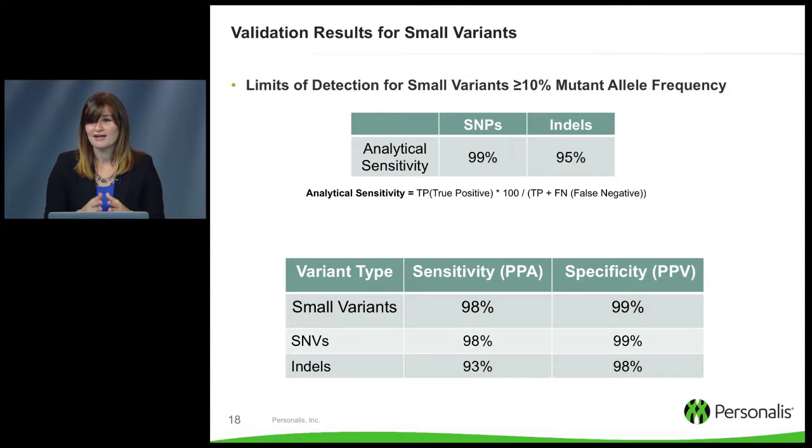We also conducted a series of reproducibility and titration experiments. So in total, validation of our ACE cancer exome required sequencing and analysis of over 70 samples and resulted in over 7,000 SNVs and 380 indels assessed. So this just stresses the fact that more well-characterized reference standards are needed for large cancer assays such as ours.